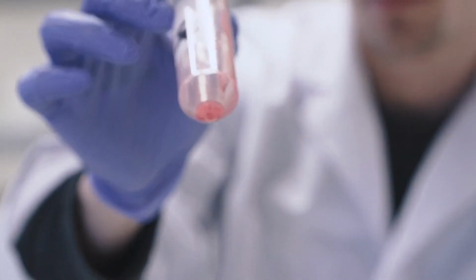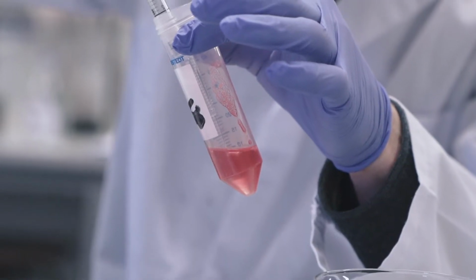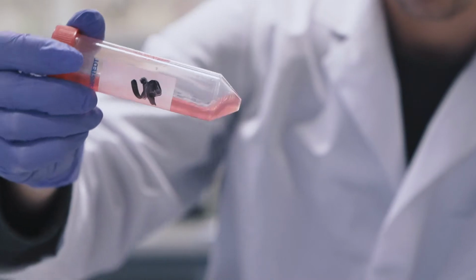Then the white blood cells are still in the pellet, and they can be resuspended either in lysis buffer or PBS before we put it in a gel for COMET assay. The solution is still a little bit red, but that is because of hemoglobin, and that will not interfere with the COMET assay.